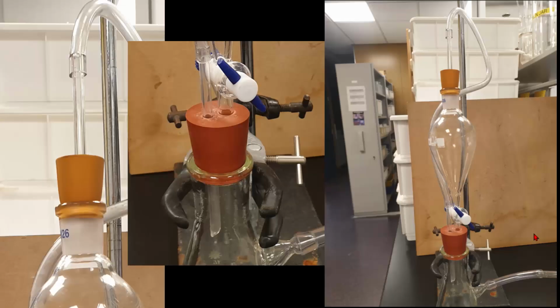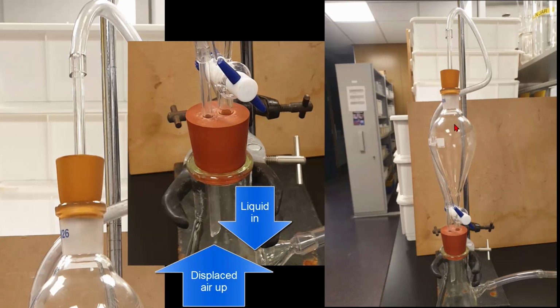So instead I've just created one using a dropping funnel that we already have. The issue is when you've got liquid in here and you let it through, so this is completely sealed so no gas can escape. When you turn that stopcock and let it through, there would also be a vacuum here. So you've got this little tube that's connecting all the way up along here. The air can come in here to replace the liquid that's gone out, so that there won't be a vacuum, so liquid will actually come out.